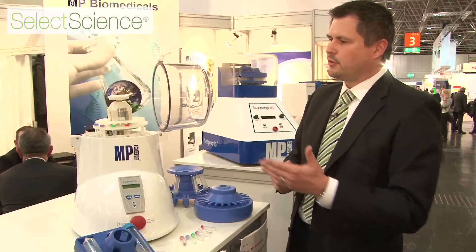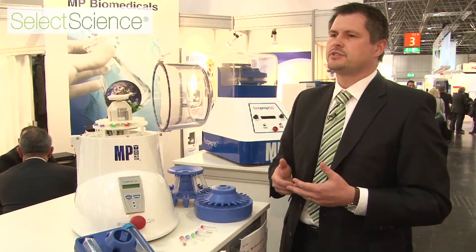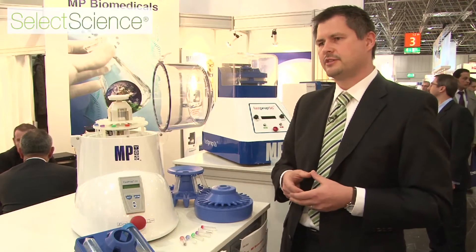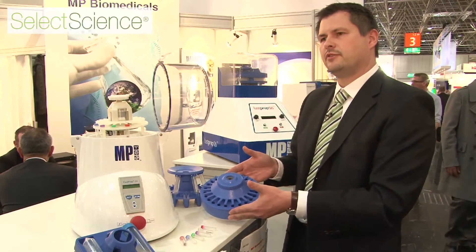If you see here, we have the adapters for 24 2 ml tubes, we have them for 15 ml tubes, for 50 ml tubes, and we also have adapters which can be used with dry ice to preserve your precious samples in terms of RNA conservation. This is the adapter for the 24 2 ml tubes that can be used with dry ice.